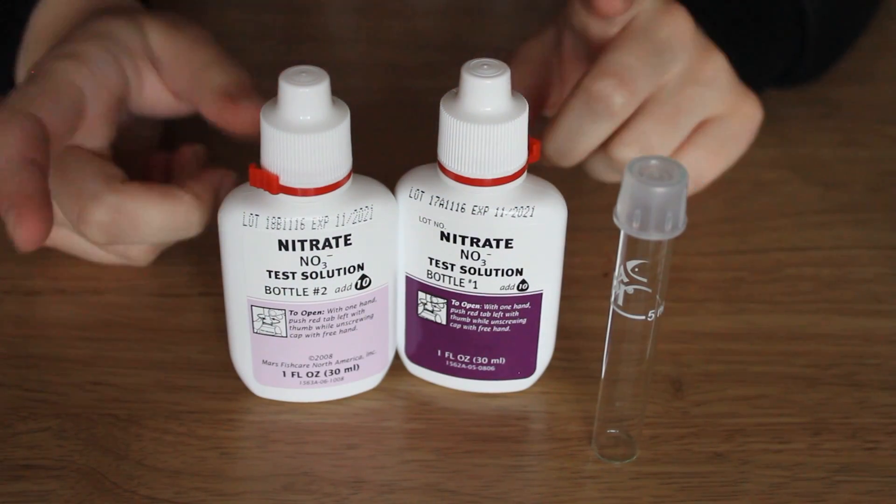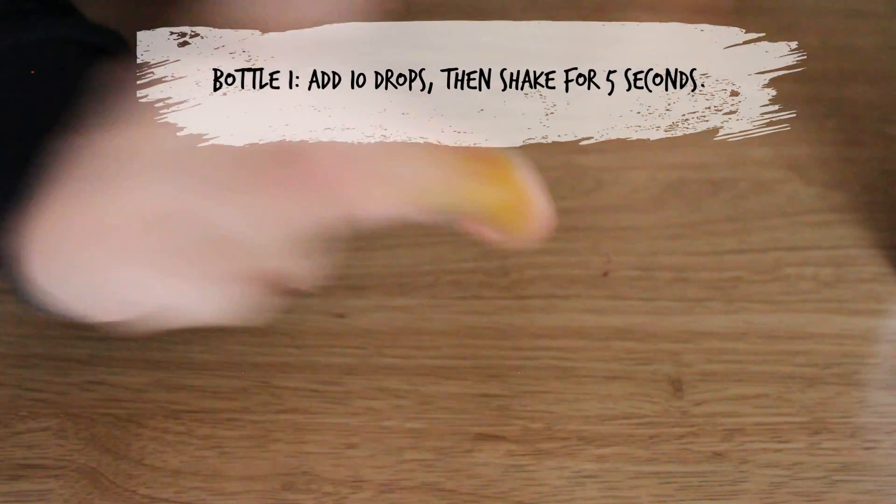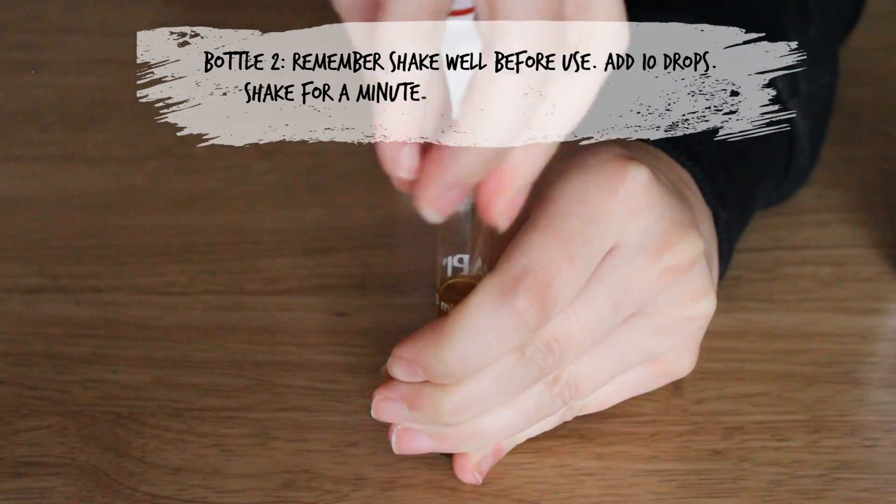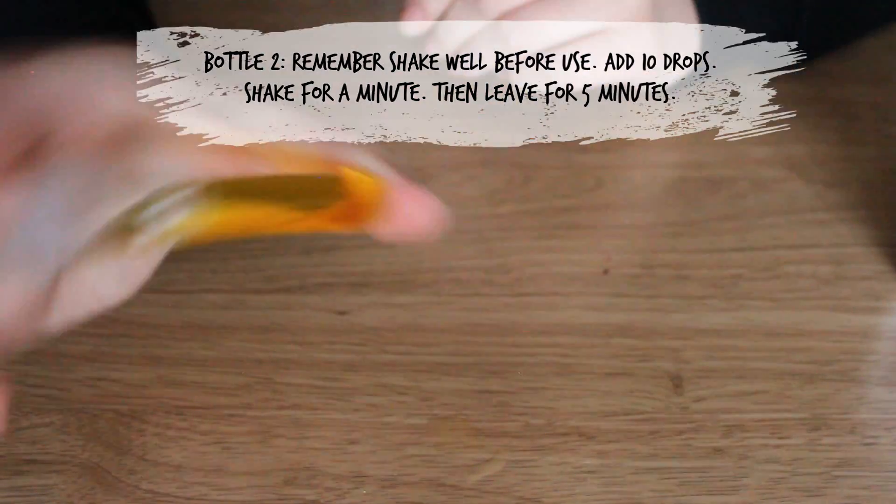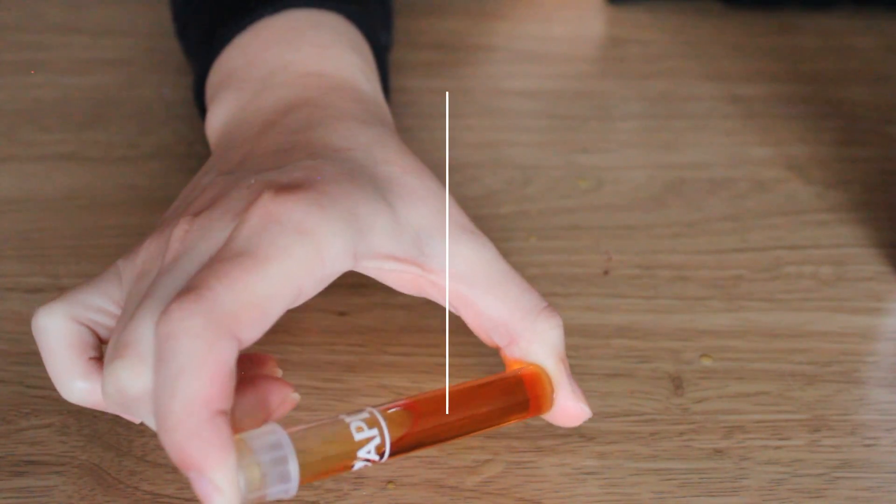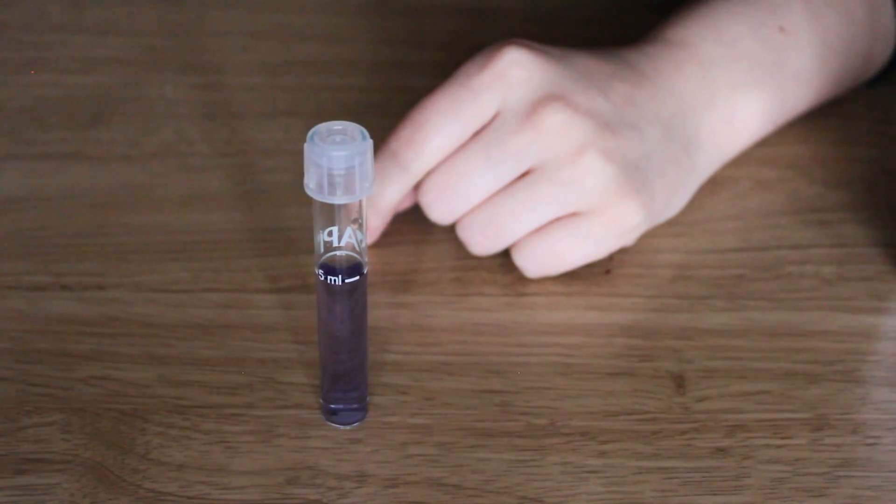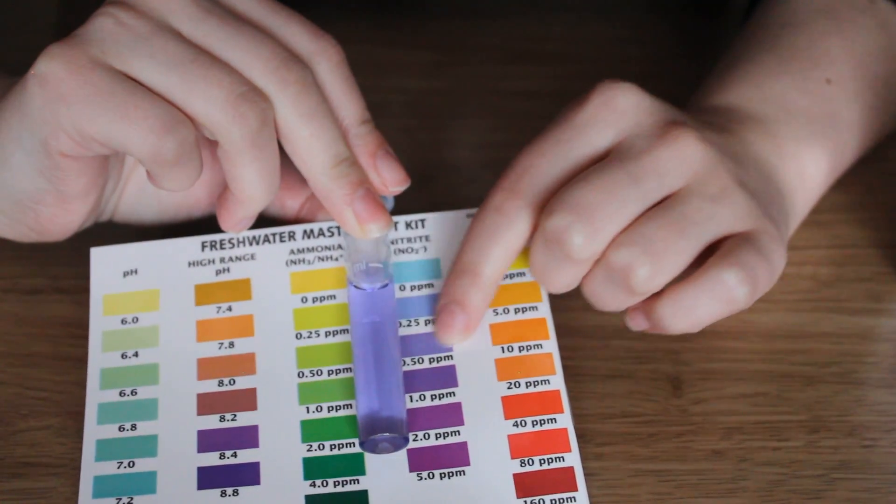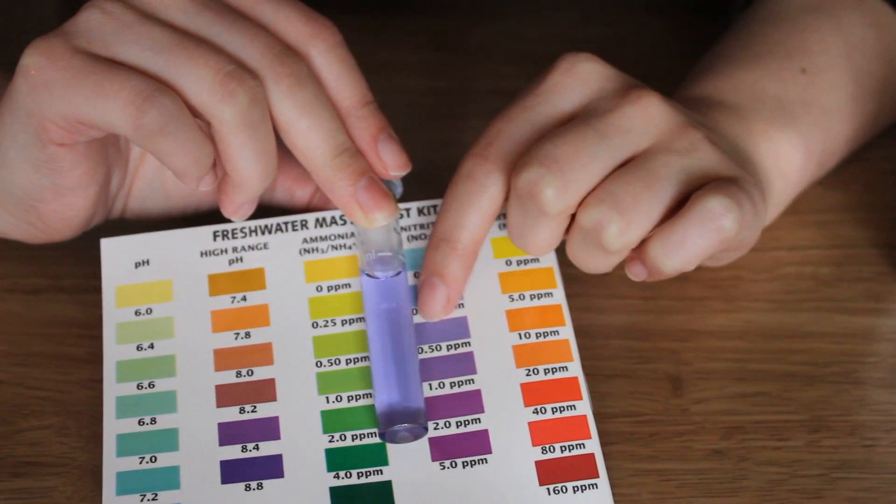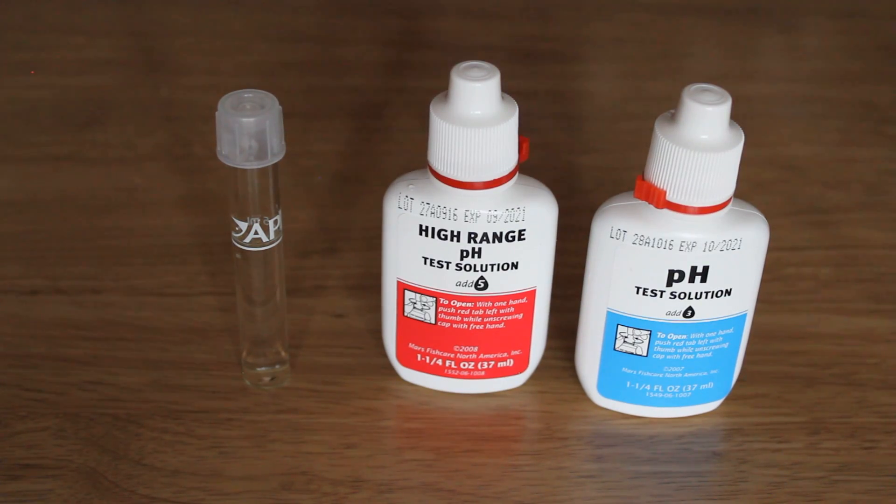Whilst we're waiting for that result we're going to do the nitrate. With the nitrate now that's done we've got to leave it for five minutes. Now we can look at the nitrite, so we'll compare it to the little thing that comes with the kit. I would say it's around here, I think it's maybe 0.50, so not ideal but it certainly could be worse.